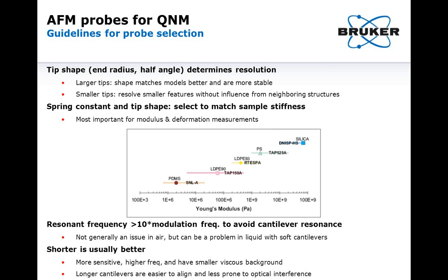Though PeakForce tapping does not feed back on the cantilever amplitude, the resonant frequency of the cantilever is important in that we don't want the cantilever resonance to be close to that of the modulation frequency. A good rule of thumb here is that the cantilever resonance should be about 10x the modulation frequency. And lastly, shorter is usually better. A shorter cantilever has greater sensitivity and higher frequency with smaller viscous background effects.